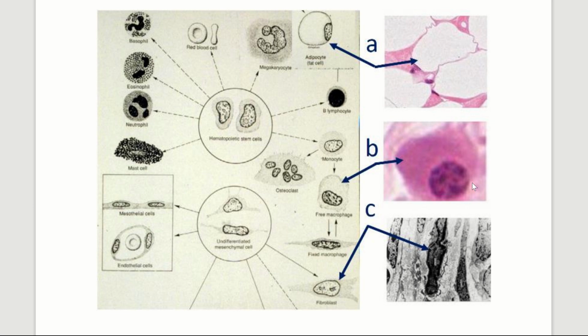And remember, what plasma cells do is they produce antibodies, right? These produce antibodies. Remember, what macrophages do is they're in charge of phagocytosis. So these two do not match, okay? They do not match in identification or in function. See, this is pointing to a fibroblast, and then this right here, this is an EM of a fibroblast, okay? It's got that very condensed nucleus, and it's got very little cytoplasm around it. You can't really see much cytoplasm around it. So this is a fibroblast as well. And remember, what those do is they are the collagen producing cells of connective tissue.